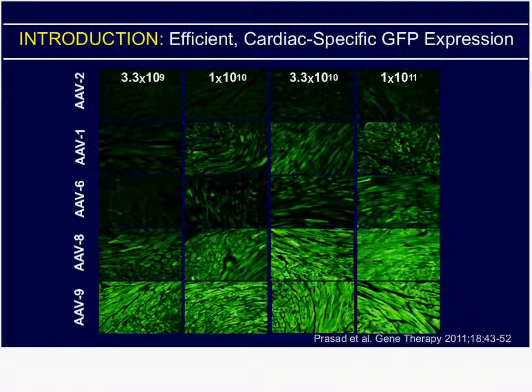And if we switch reporters to GFP, we can prove to you that at reasonable doses, we're not just hitting every cardiomyocyte in the LV, we're hitting the cardiomyocytes multiple times over. So these extra white cells represent cells which are expressing 5 to 10 copies of GFP.